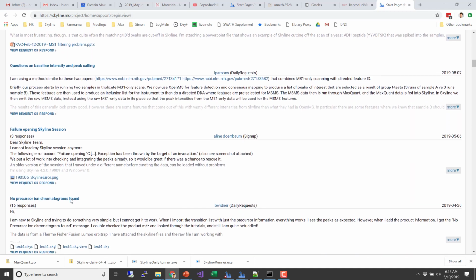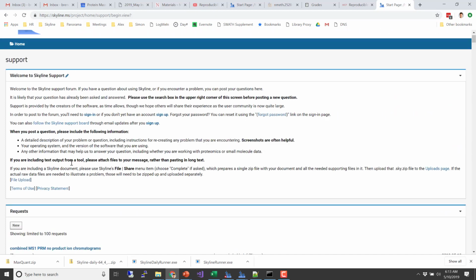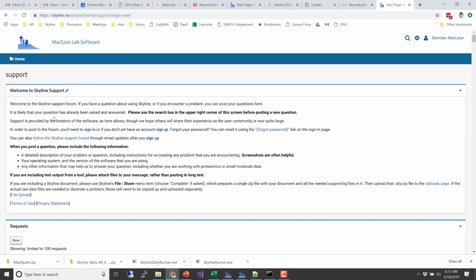Yeah, so if you get that report, and I think you can get it off the Spectronaut website, then you can produce an assay library, and that's what they'll tell you to do. If you say, oh, I want to use Spectronaut, and you talk to the Biognosis people.